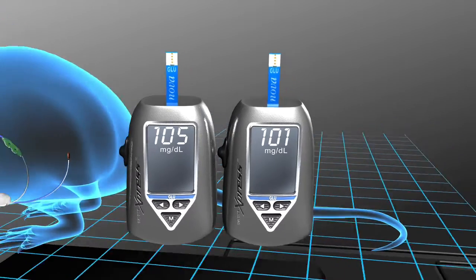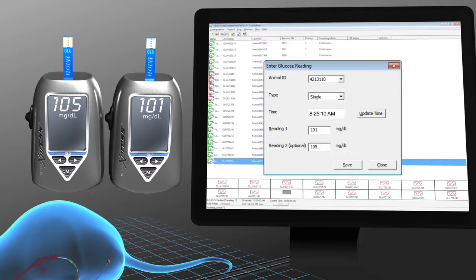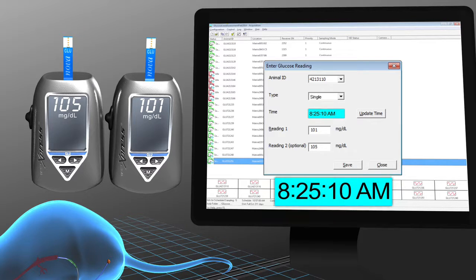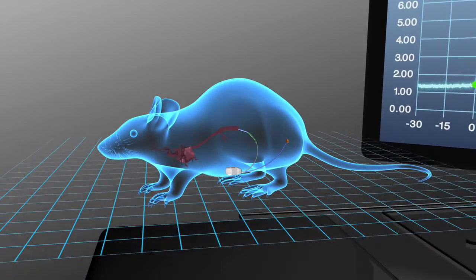Record the baseline calibration values from the glucometer in DSI software or a spreadsheet. The exact computer time and corresponding glucose value are required.